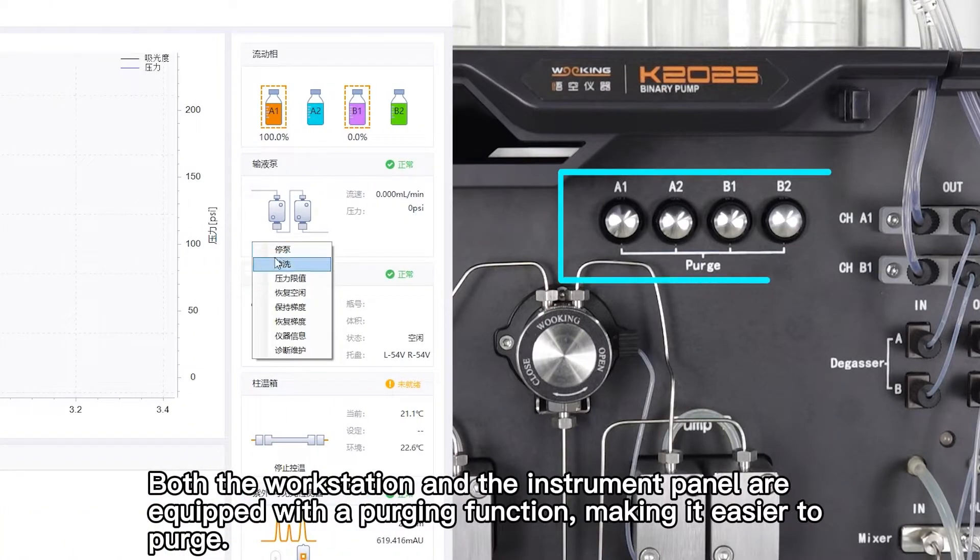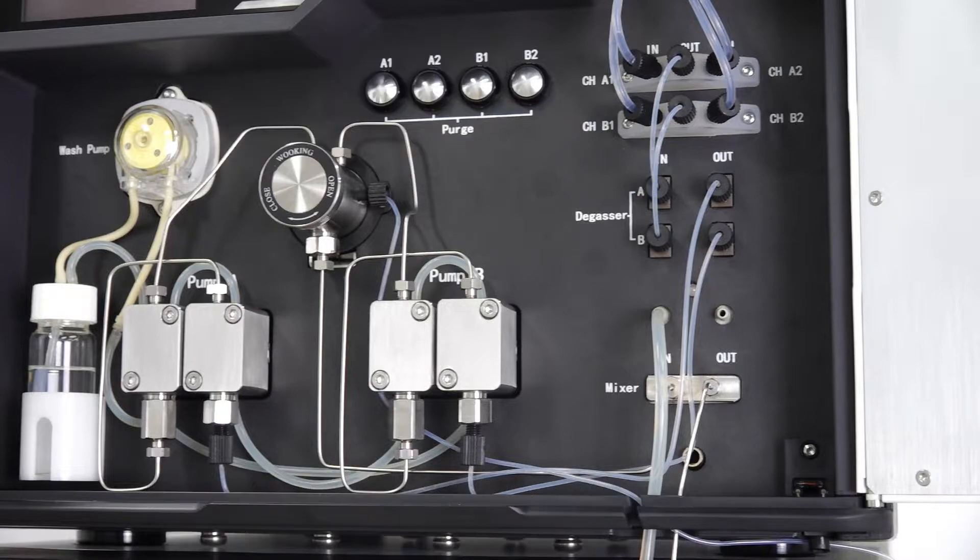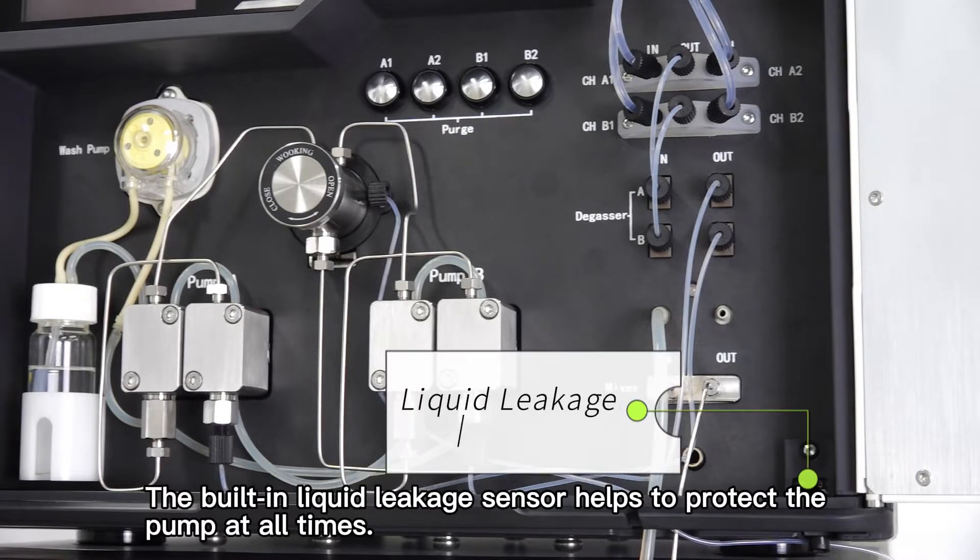Both the workstation and the instrument panel are equipped with a purging function, making it easier to purge. The solvent is degassed online, which can effectively improve the stability of the pump. The built-in liquid leakage sensor helps to protect the pump at all times.